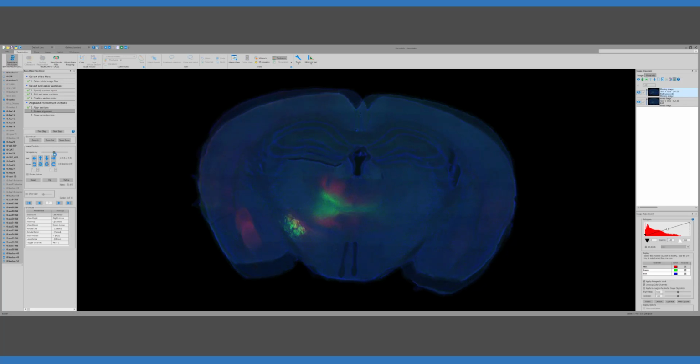Now I'm rotating just to emphasize that there are in fact two sections there. The other thing I just wanted to call attention to is that when you do make those changes, you can make small adjustments, or if there was some misalignment for a particular section, you can initialize the alignment. You can kind of get close and then hit the refine button. And what that refine button does is it runs a number of iterations of that image registration process that we just went through using the image content.